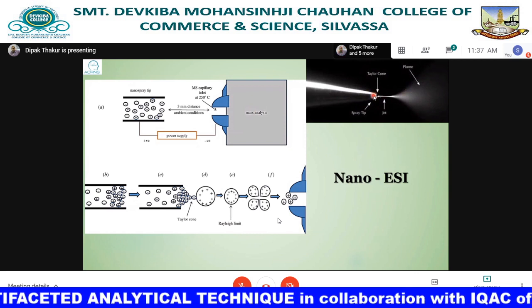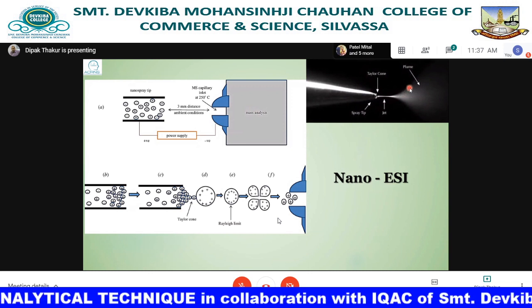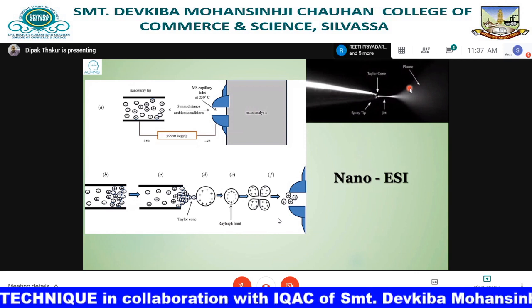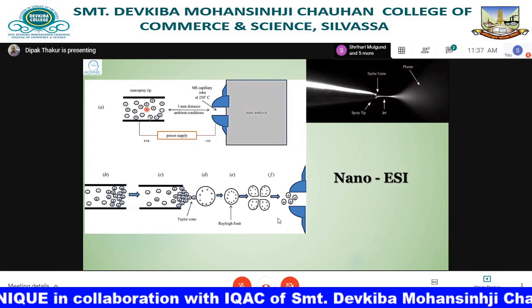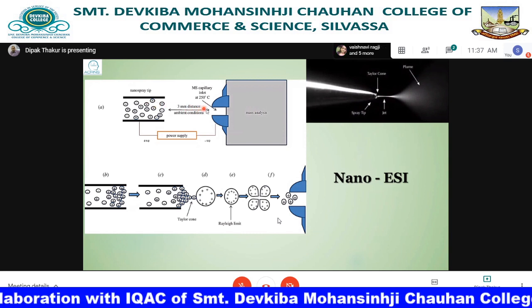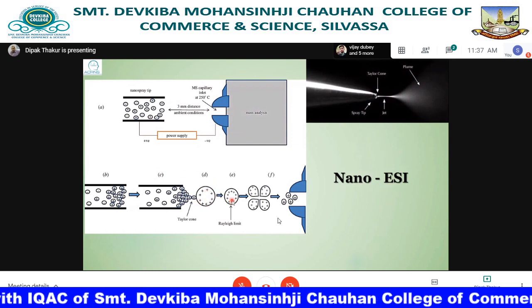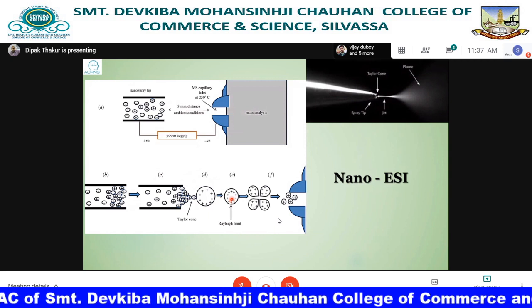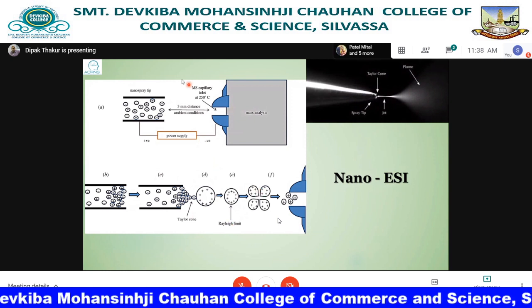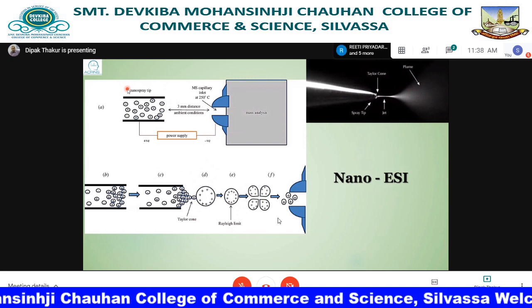Think about it, if your flow rate is low, the droplets are already low in size, they evaporate, and the efficiency of ion generation is very high. So if your sample is already very low, that sample has the opportunity to enter into the mass spec. But here there are chances that some big droplets fall down, they may not evaporate, and therefore the efficiency is a problem here. But it's not a problem with nano spray tips and nano flow based electrosprays.